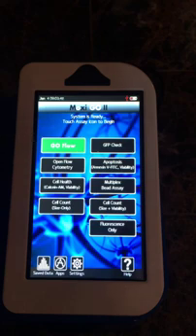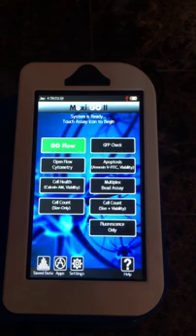We've also got a GoFlow app, so if you're simply wanting to run two channels of flow with combined cell count and cell volume output, you would just click and go and then pipette in your sample.